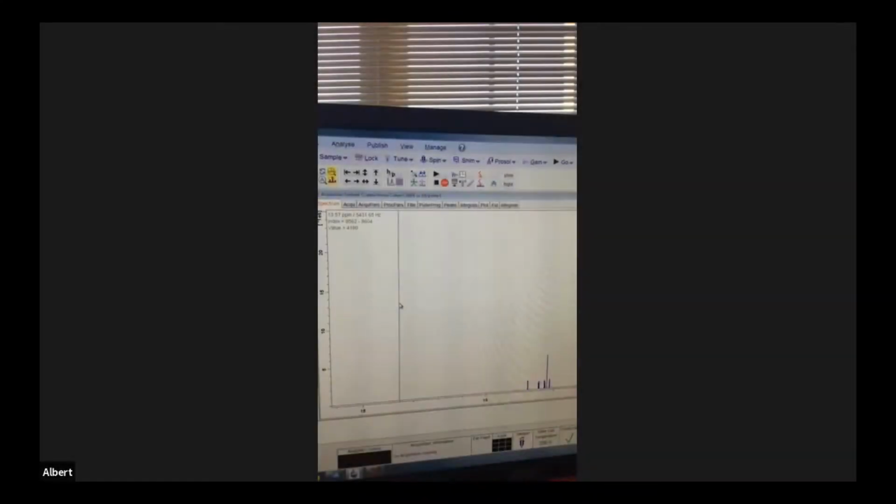So once that's done, I want to click stop. And then I'm just going to eject the old sample. And then we'll run another sample. It's the same for all of them. So that's clean. Sample 3 is super clean. Mine's going to be dirty.